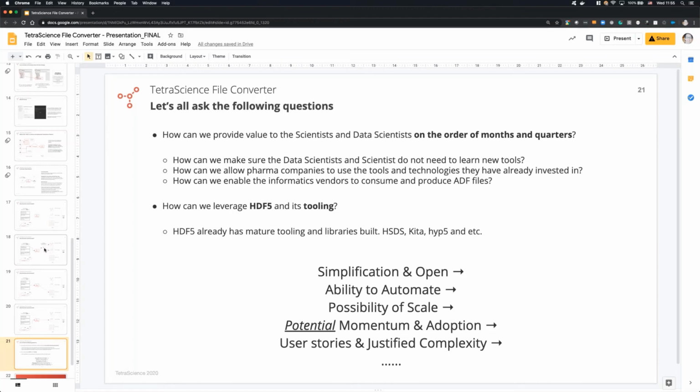It doesn't matter who produces that library. This time it's the foundation. The other case is the Thermo library, but it's one entity that produces that, and that is not open source. At least the Allotrope one is not open to everyone. Even if it is open, that's not the point. My point is that you need to use one library to create and the same library to read. Yes. What about HDF5 then? Yeah, HDF5.